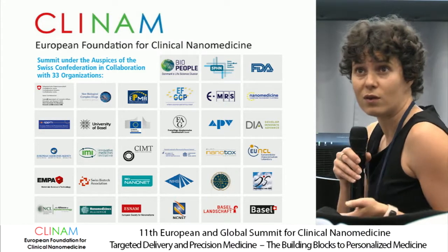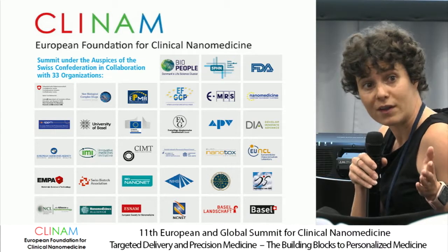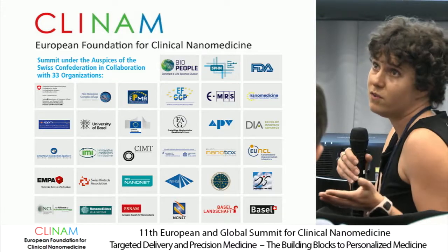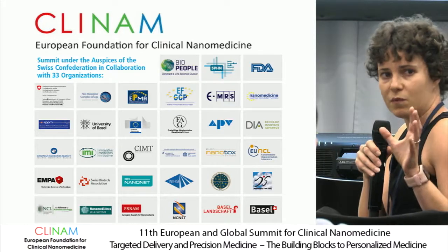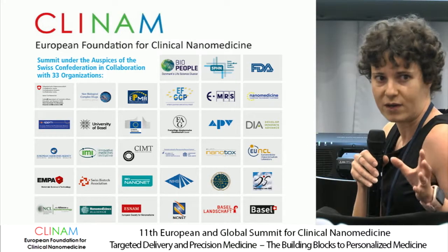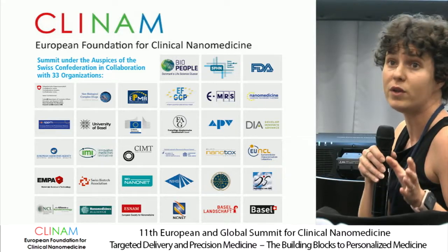somehow compatible with the particles that you are measuring. For sure you can select the size range according to the size range of the particles that you are expecting. For example, if you have a polydispersed system but you expect a different population in some size range that you know, then you may select polystyrene particles or another standard in the same size range, but they may not have the same chemical properties as the material that you are measuring, and with some techniques that can be critical.